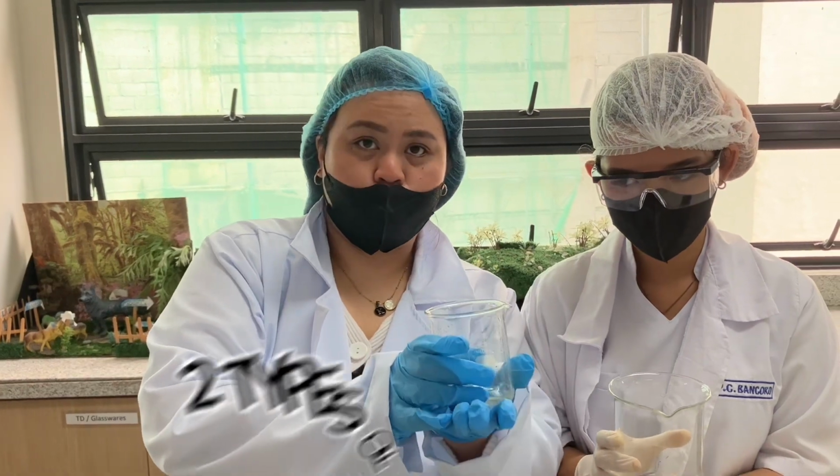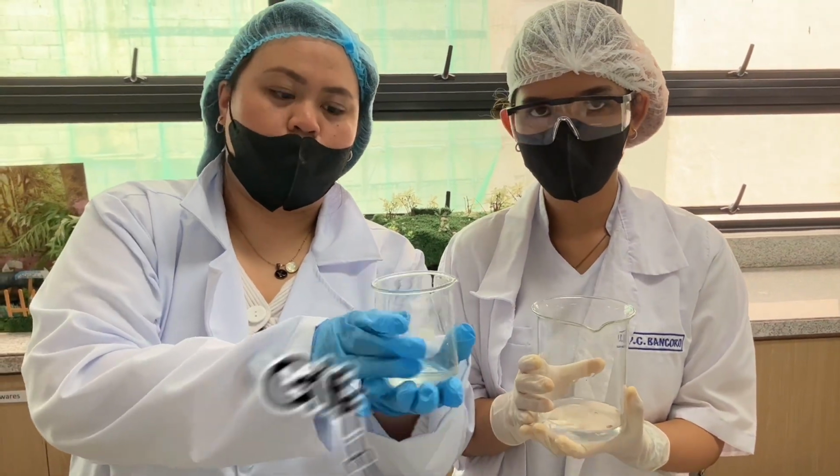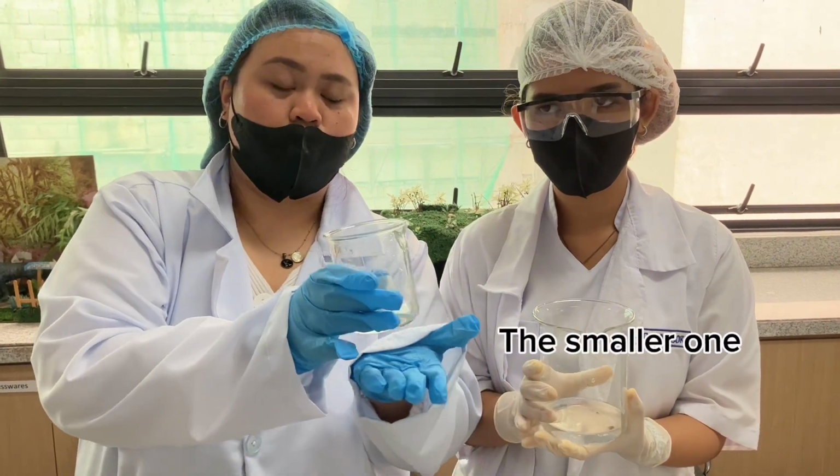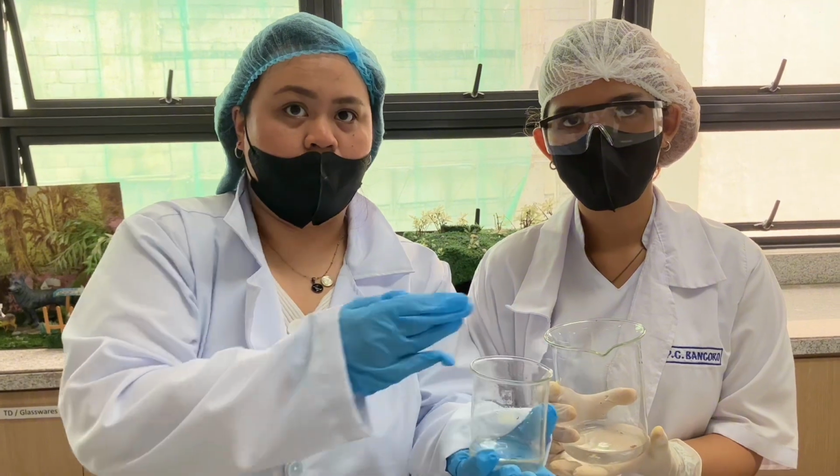We have here two types of beakers. We have the regular beaker and the different beaker, which is a smaller one, and it only holds 40% of the volume of the regular beaker.